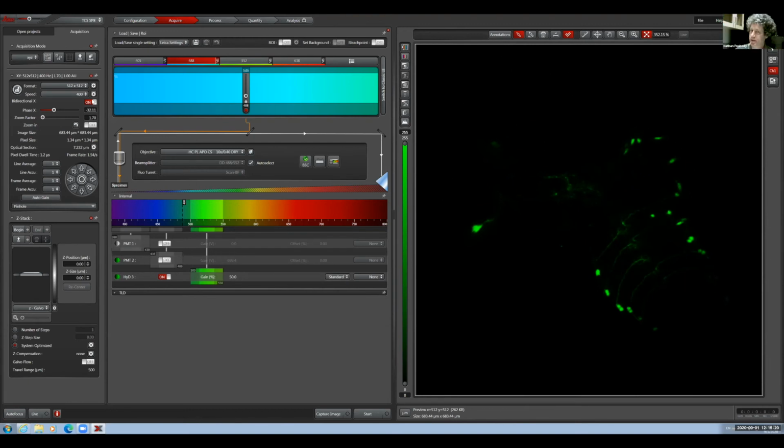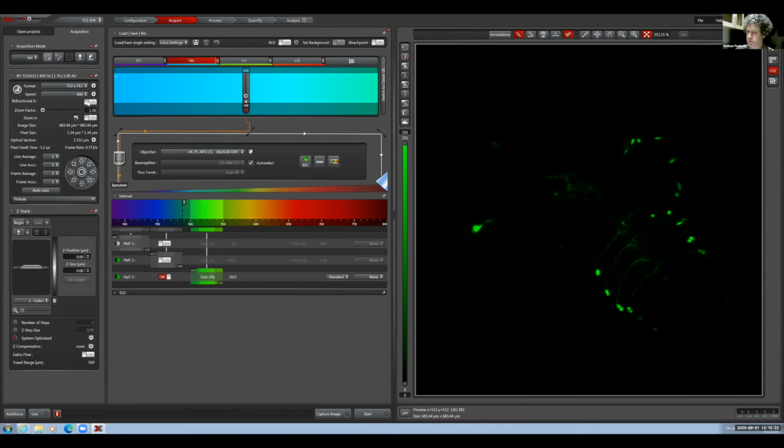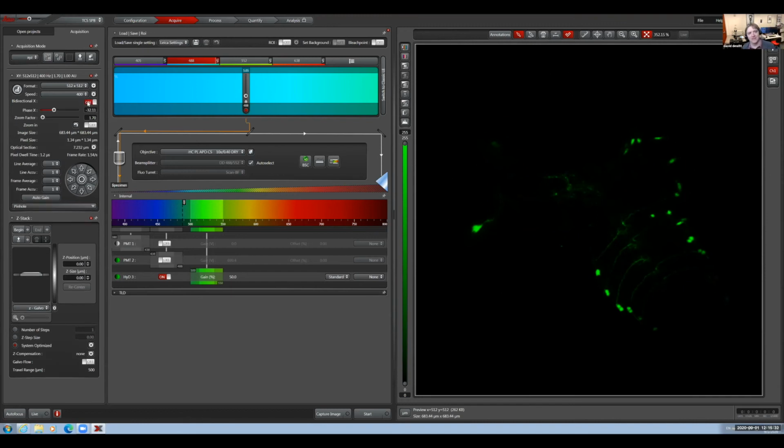Does that have an effect on the image or does it just make it faster? It depends on the age of your system, actually. Yeah, it makes it twice as fast with no effect on the image. Okay, that seems like one I probably want on all the time. Yep, it's free speed. The only downside is you then have a phase, which is the alignment of things that are read from right to left and left to right.